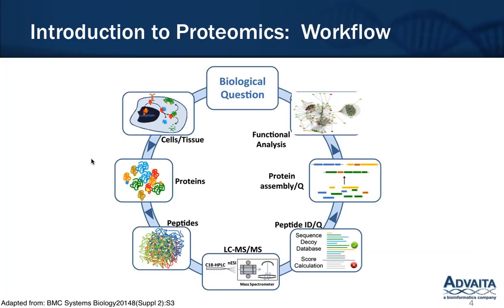So briefly, I wanted to introduce everybody to the proteomics workflow, because I'm not sure what exactly the background is of all the attendees, and it is a relatively new workflow. So you start out with a biological question, and you have cells and tissues from which you extract proteins. And then these proteins are digested with a protease or a combination of proteases into peptides. And these peptides are then sprayed onto a liquid chromatograph coupled with a mass spectrometry machine.